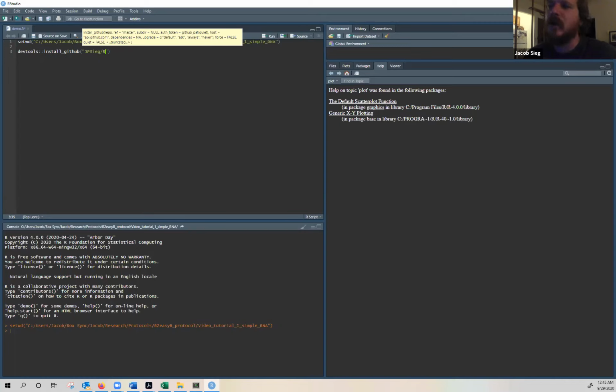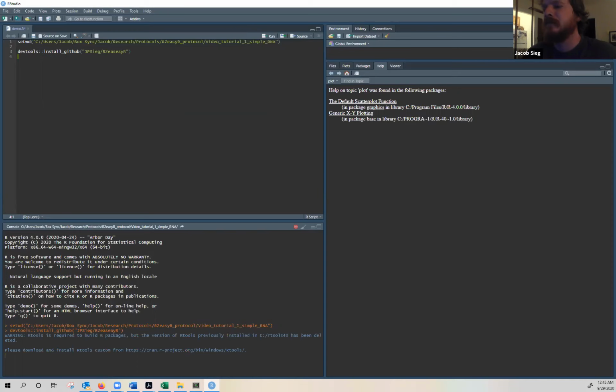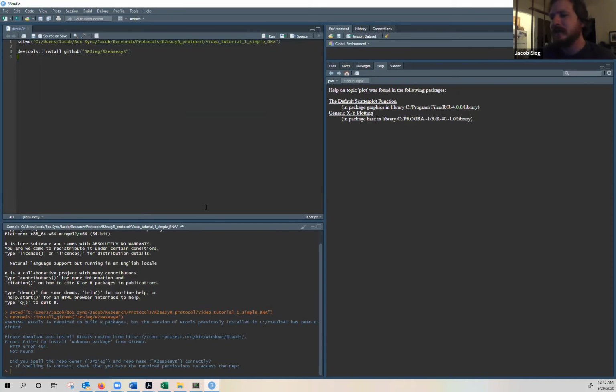And the package is called R2easyR. And it's going to throw you some error message because, oh, wait, I spelled it wrong.